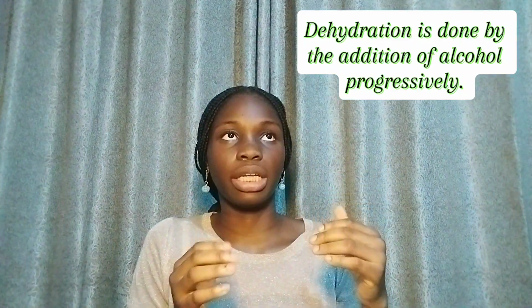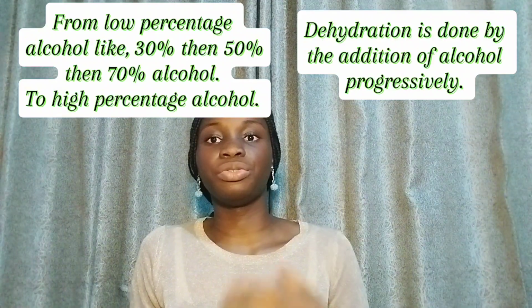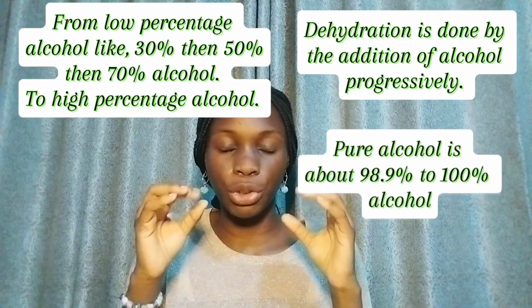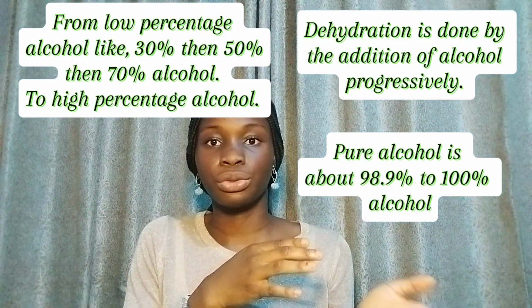So you start from a low percentage alcohol, like 30% alcohol for 15 minutes. Then you do 50% alcohol, then you do 70% alcohol, and you keep adding until you get to pure alcohol, which is like 98.9% to 100% alcohol. So that's the second step. Basically, you dehydrate by adding alcohol.